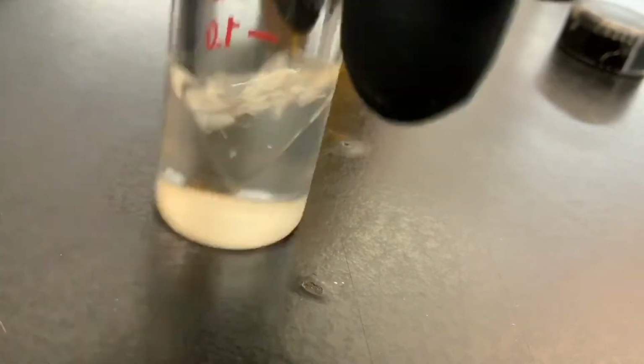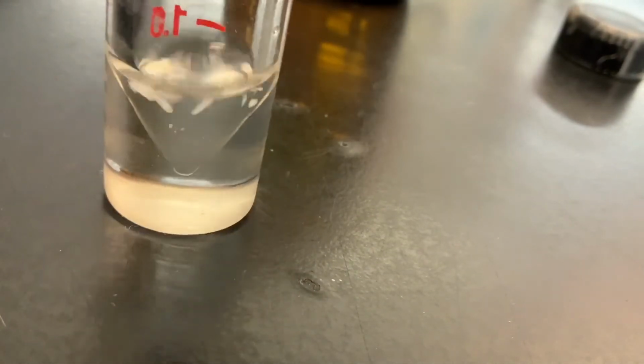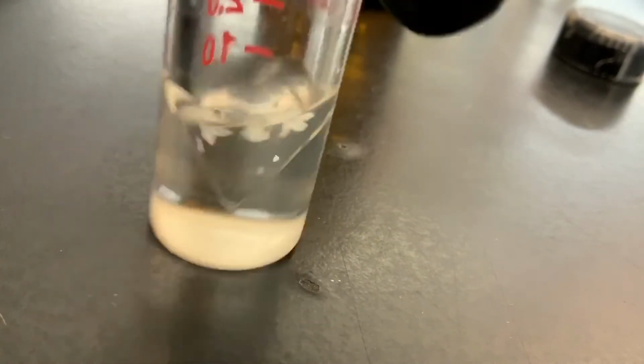And based upon our knowledge of the functional group, the carboxylic acid in its unionized form, and then also the benzene ring, we could say that this is going to be more soluble in the organic layer. So this will eventually dissolve in our methylene chloride.